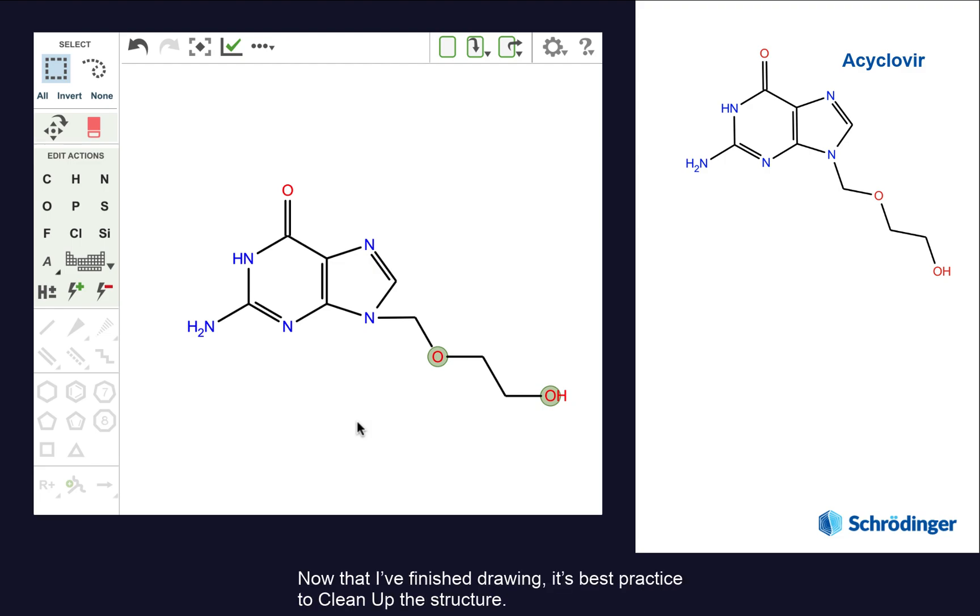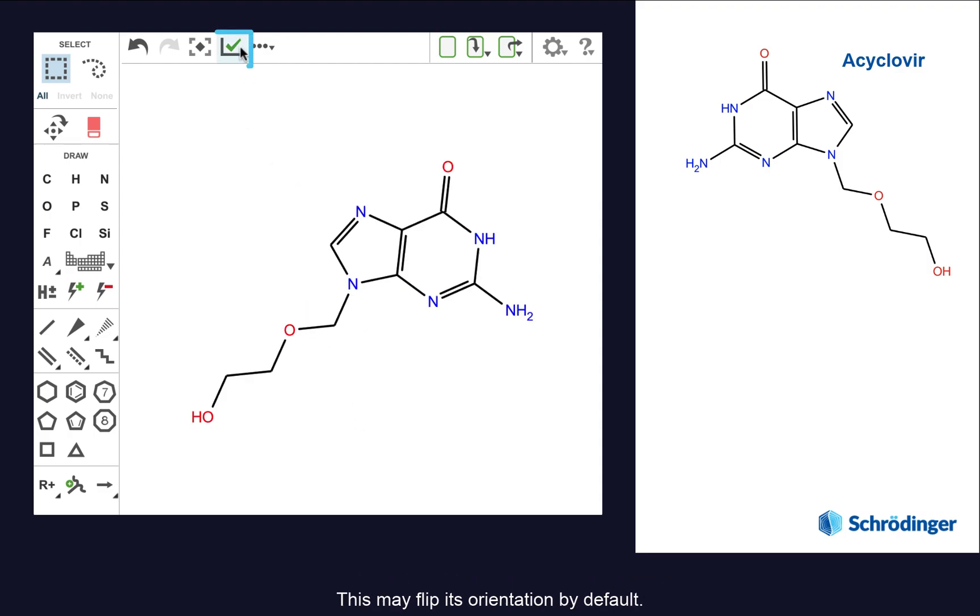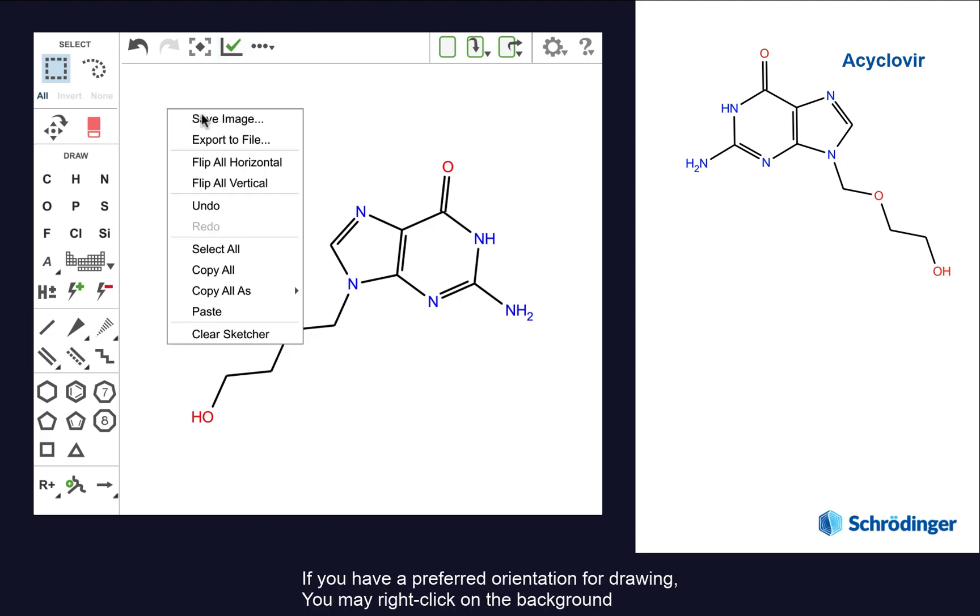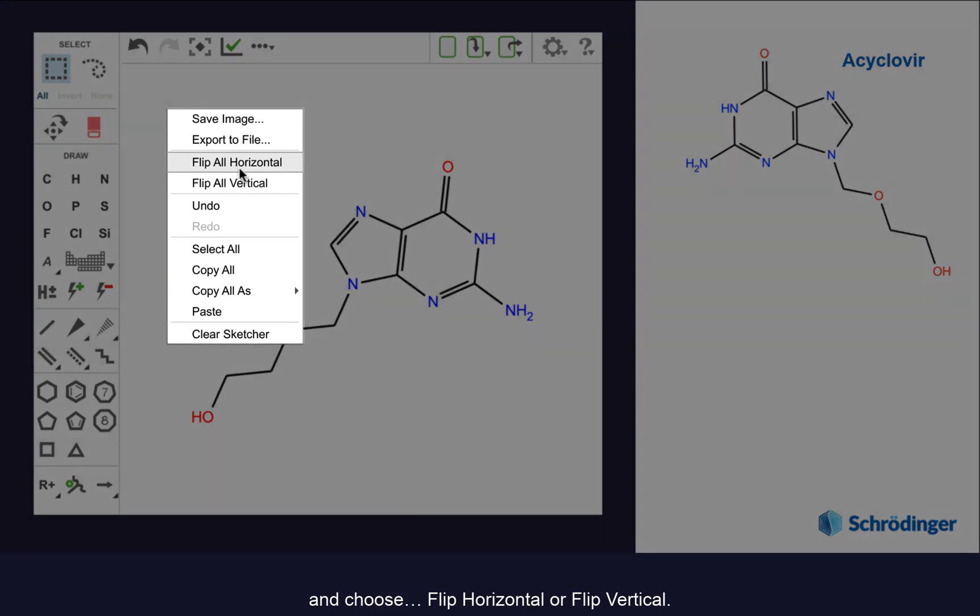Now that I've finished drawing, it's best practice to clean up the structure. This may flip its orientation by default. If you have a preferred orientation for drawing, you may right-click on the background and choose flip horizontal or flip vertical.